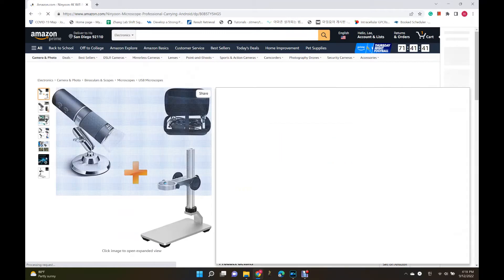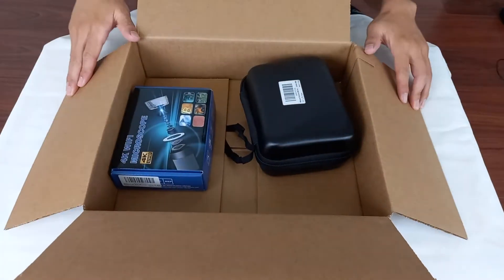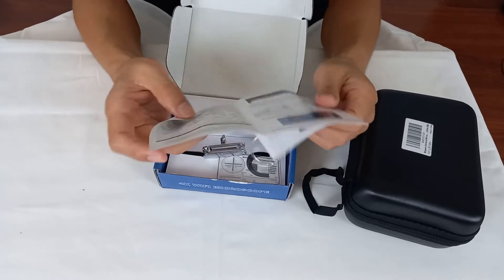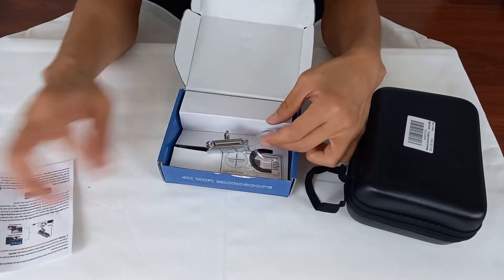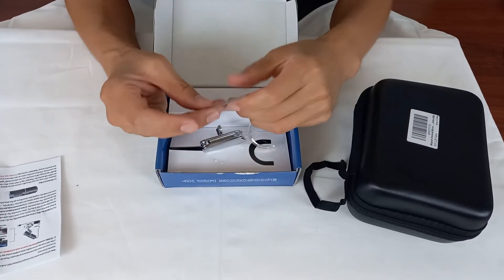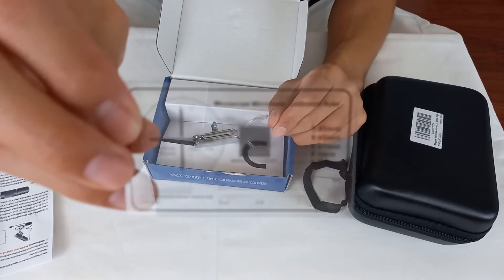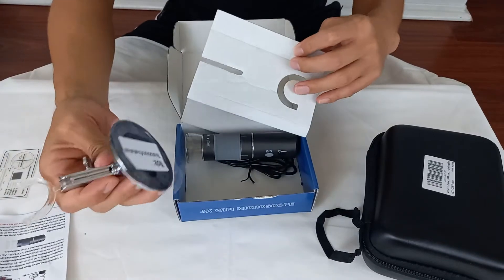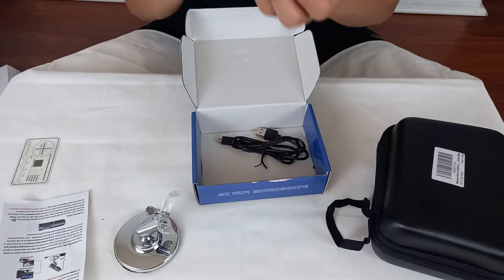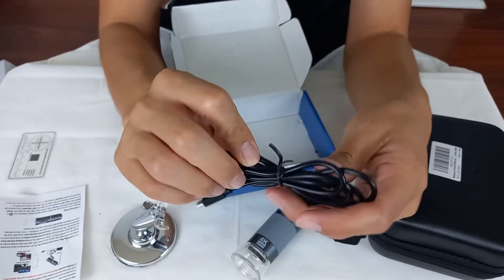I also bought a stand for easier observation. Here's the microscope — let me open the box. There's a manual. The microscope came with its own stand. And this is a very precise ruler that can test the microscope. Of course, the microscope is included. There is also a cable for charging or connecting to a computer.